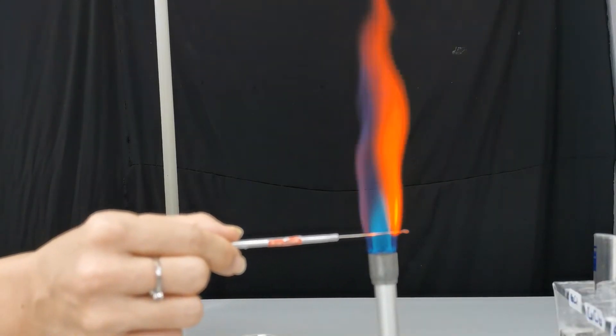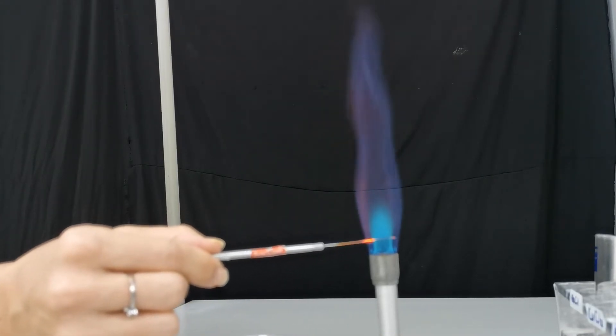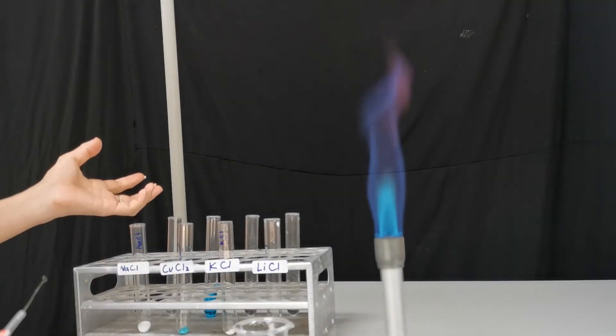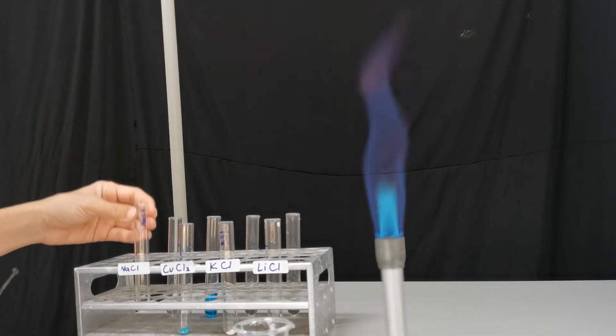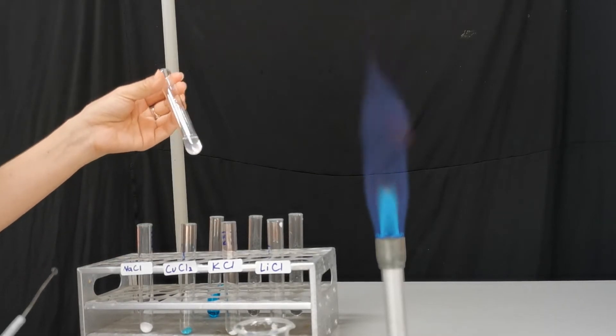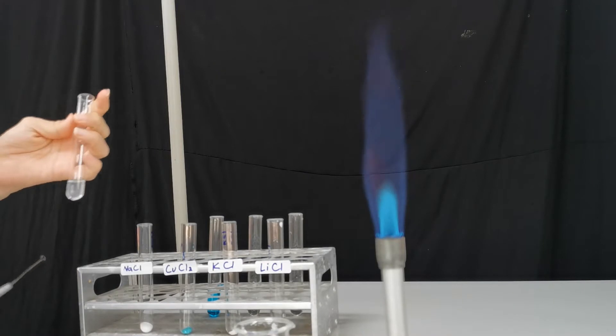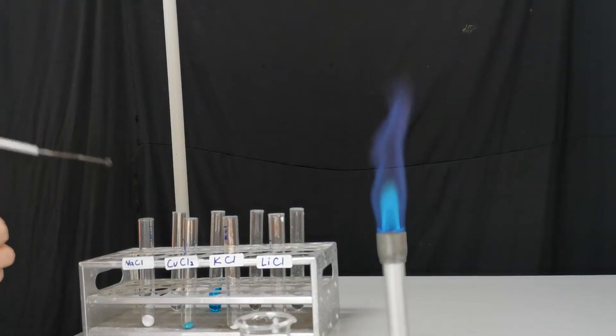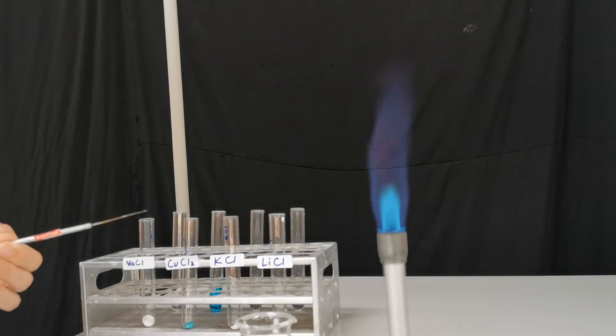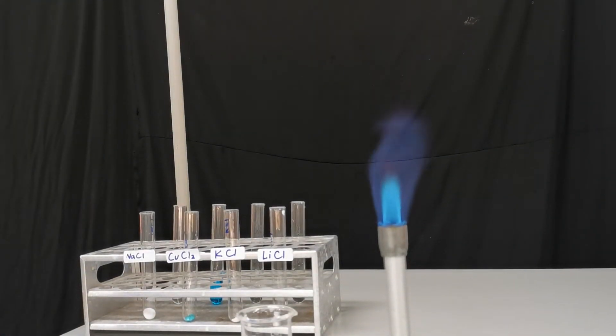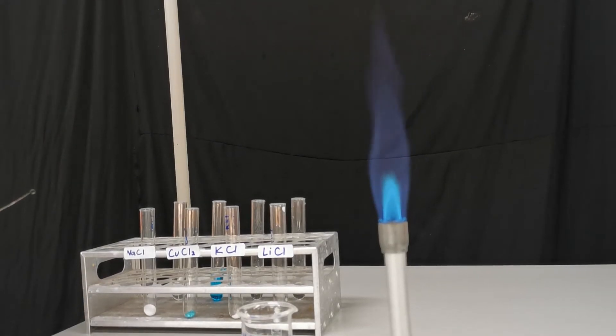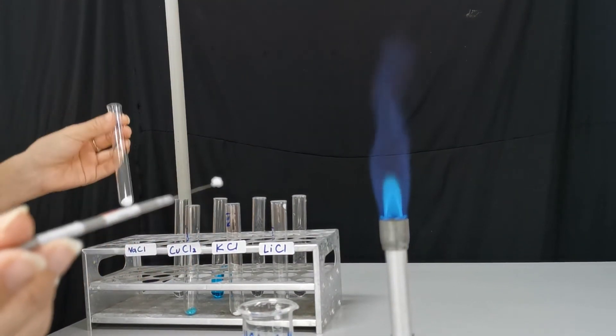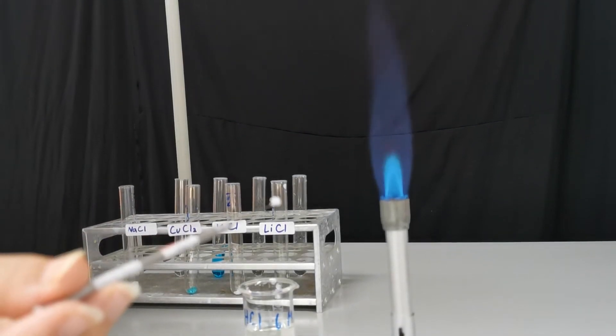Let's do our first test. I'm going to be using the solid sodium chloride and also the solution of sodium chloride. Since sodium chloride solid will not stick on the loop, I have to make the loop wet first. So I'm going to use distilled water to wet the loop. Now that the loop is wet, I can easily catch the sodium chloride crystal on it.